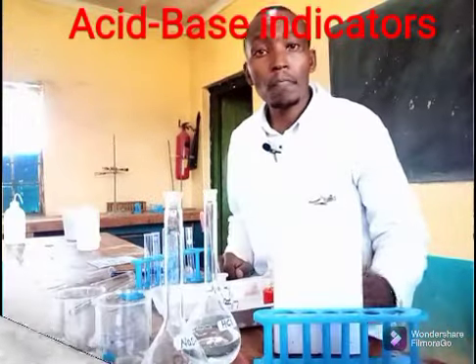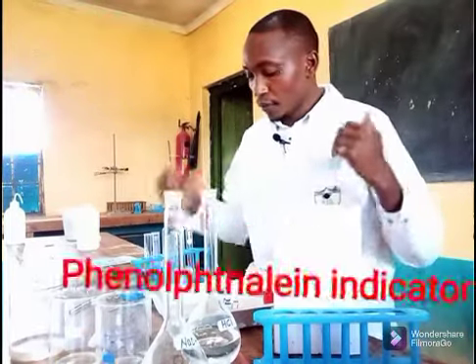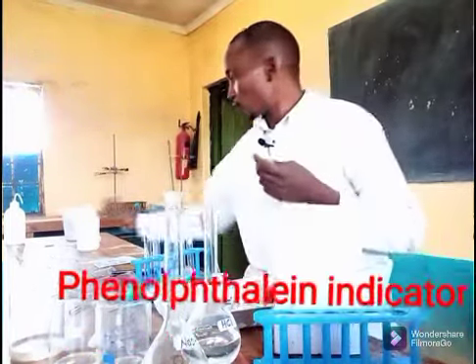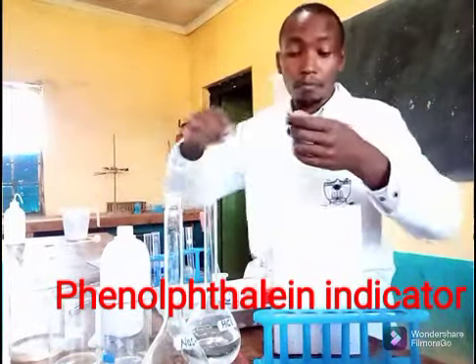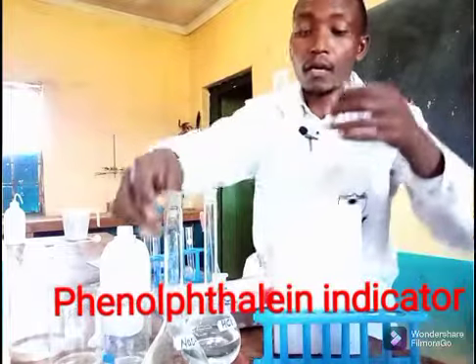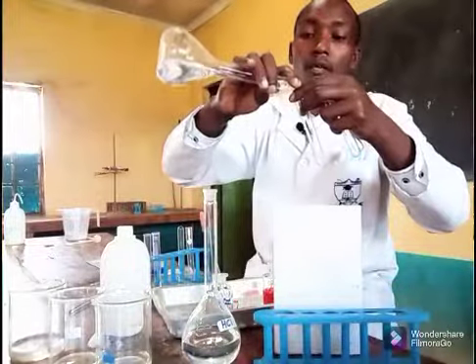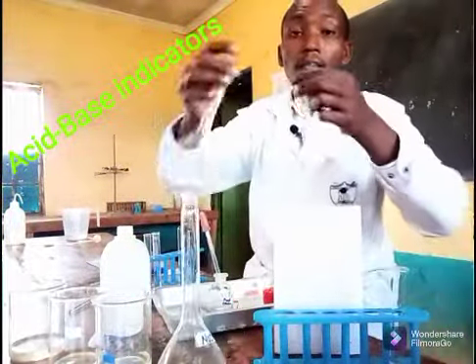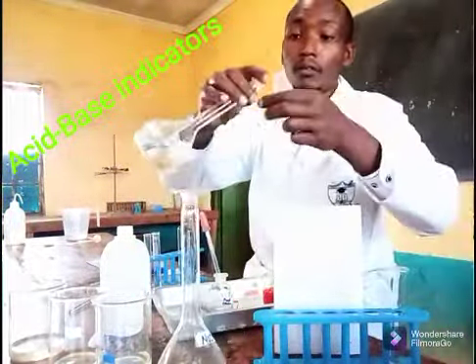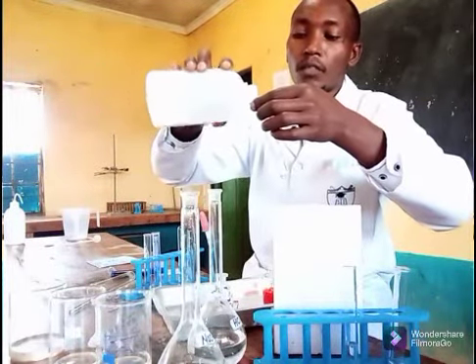Now after using the litmus paper, next we try the phenolphthalein indicator. So what am I going to do? I'm going to use just the three sample solutions or substances I had. I started with the base, that is sodium hydroxide. I'll have a little sample of it. Then the next is the acid.